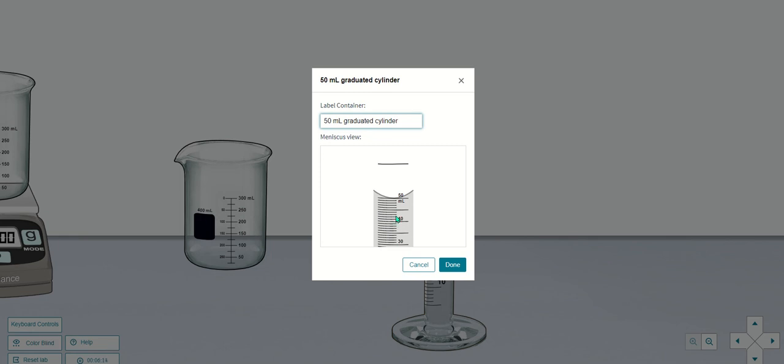Wow, I completely misread that. I was looking at this and thinking, oh, it's 49. Anyway, what this is actually going at is by 1 ml increments. I totally had a brain fart.